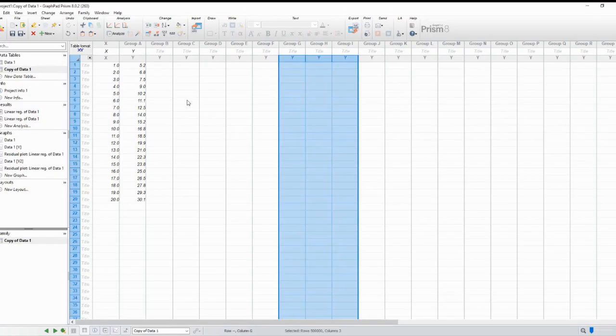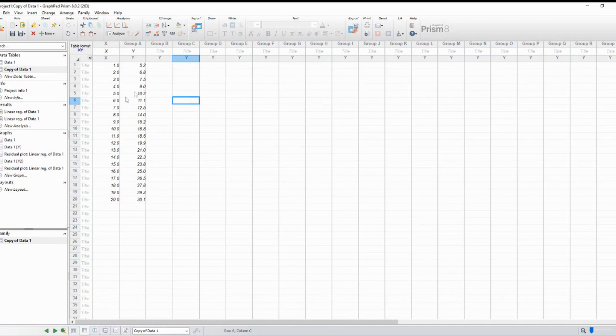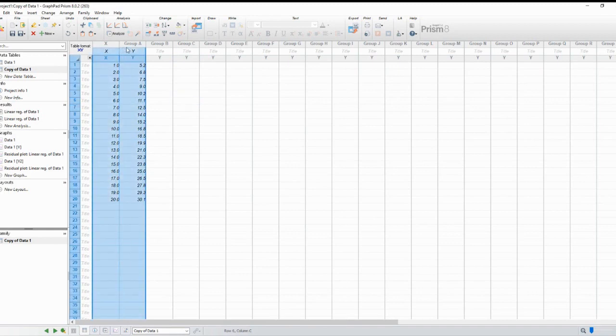The first step is to open GraphPad Prism and import your dataset. You can either copy and paste the data or import it from a file. Make sure your data is organized correctly, with each column representing a different variable and each row corresponding to an individual observation.